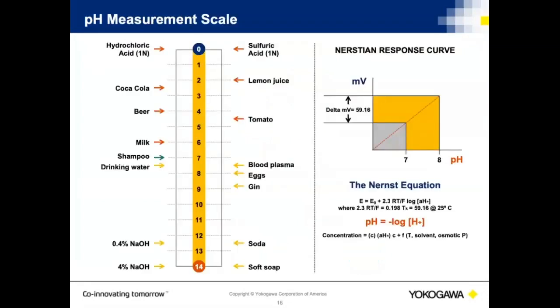This is a really fun slide because it helps illustrate in some realistic terms what different pH levels are. We've all heard the term pH balanced shampoo on commercials over the years. pH balanced shampoo, I wonder if it really was at 7 pH, but the ones I like to illustrate are my favorites, like I like beer.